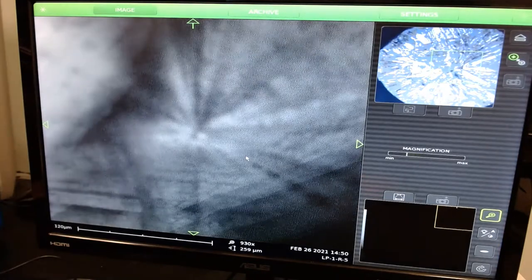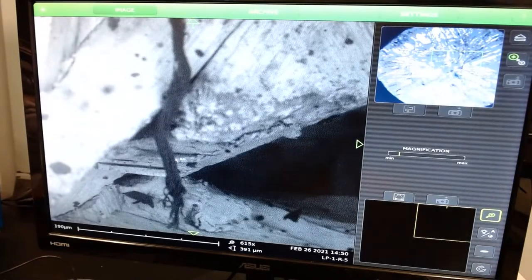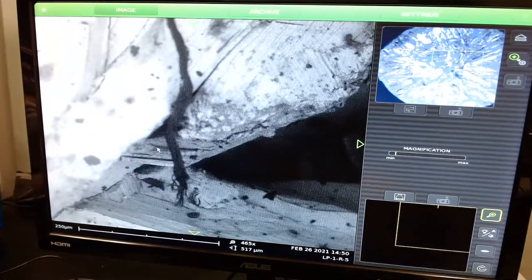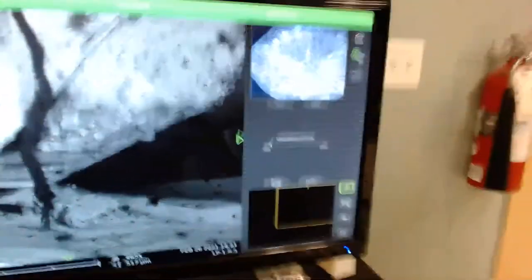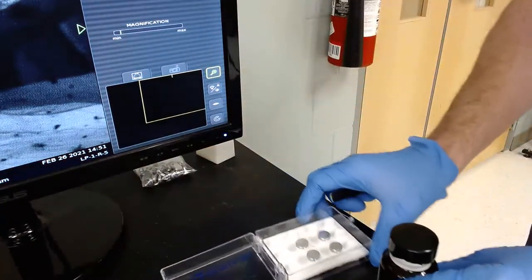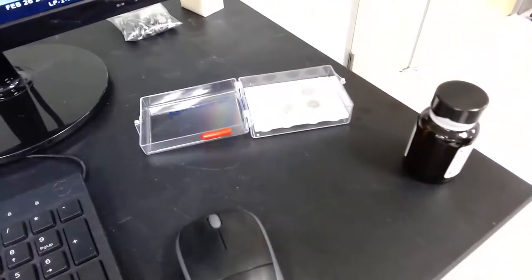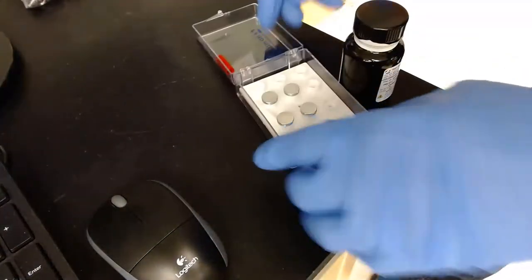It's backward. Hey, do you think that anyone would be interested in seeing sample prep? Oh yeah. Walk us through some sample prep. Are you going to do it on the camera? Yeah. You want to aim it down, and then we'll look at this, and then after I've got the sputtering system ready, we can take it over. I'm taking all direction from Natalie. Is that instead of the sticky tape to adhere it? Yes. So okay, gotcha.